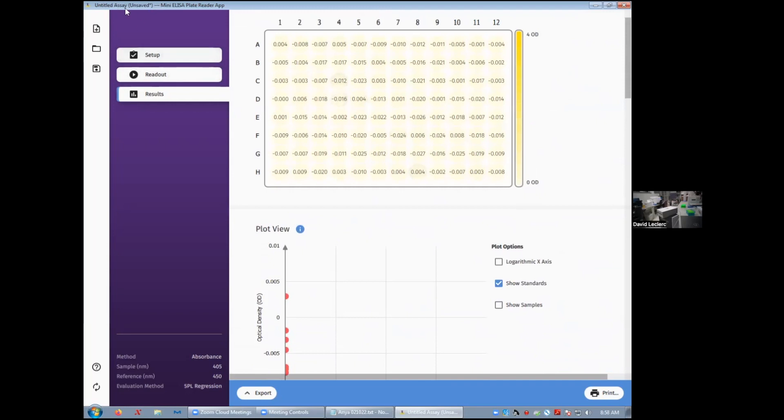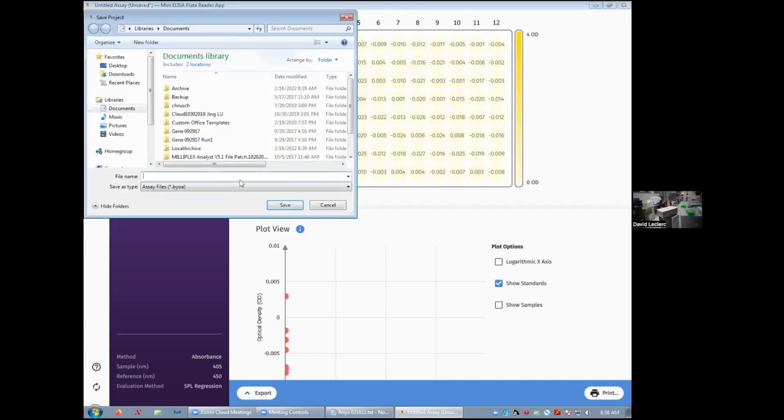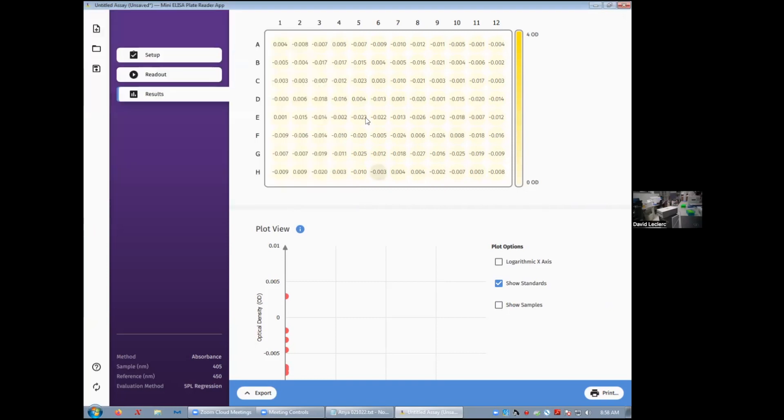The data is unsaved. And so I would make a point of saving that data by clicking on this floppy disk over here. What we save is a .byoa, which I believe stands for bring your own Armagnac? I don't know. Just give your assay a name. Essentially what you're saving here is a file that you'll be able to revisit using this specific app.